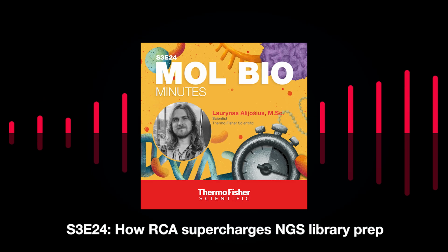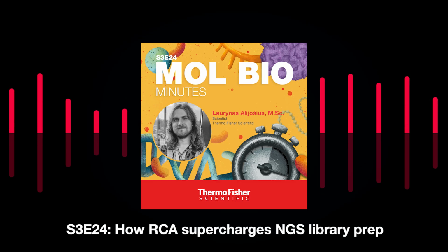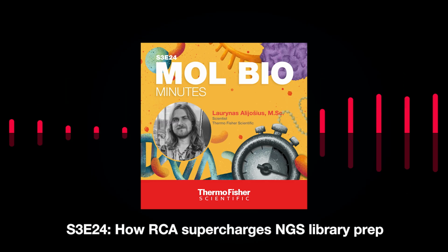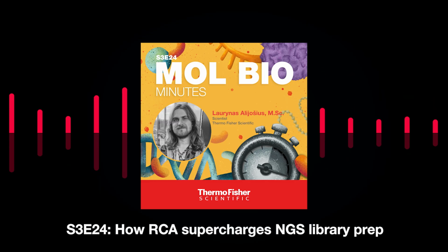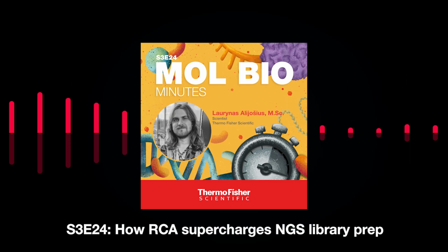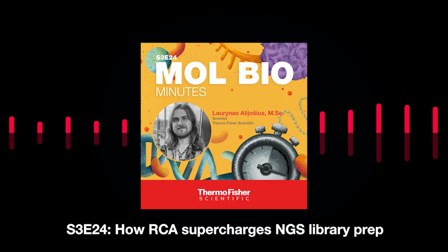So as you can see, there are many applications where RCA or WGA can help you in improving your NGS library quality. However, RCA and WGA applications are not limited only to the amplification or downstream NGS applications.